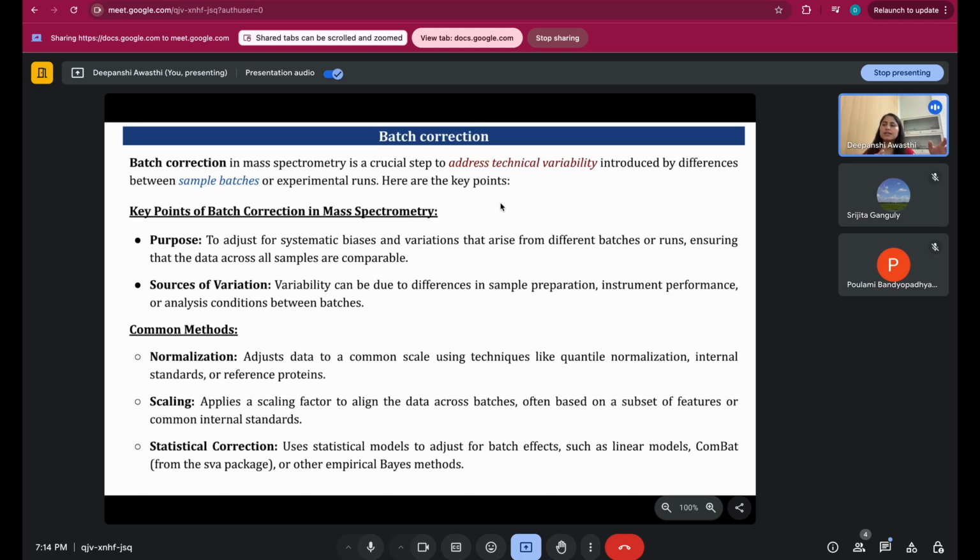You should not perform experiments only on normal samples for a few days, and then after 3-4 days perform experiments on the cancer samples. You should do random sampling from both kinds of samples. If you don't, there could be batch error, because it depends on the conditions in which you performed your experiments, which could introduce technical errors. To remove them we have to perform batch correction.